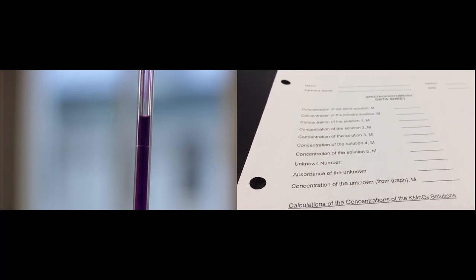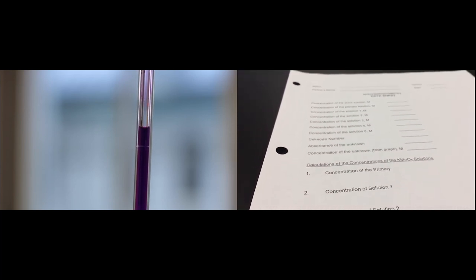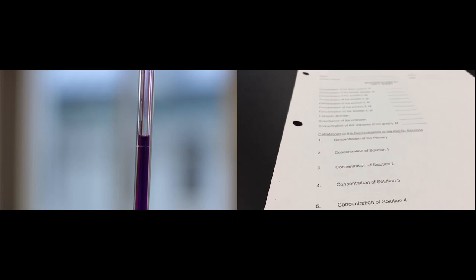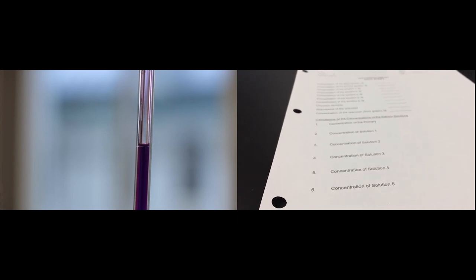While one partner is pipetting the water and primary solution, the other partner should calculate and record the concentrations of solution in each beaker. These values will be needed for LoggerPro.